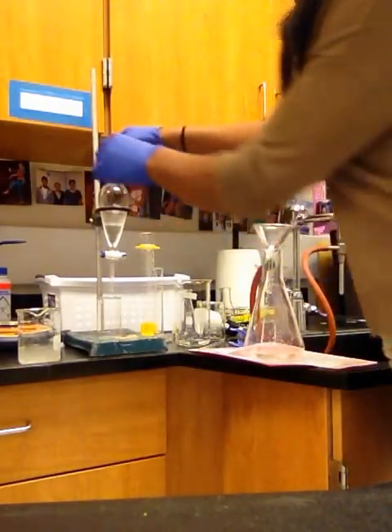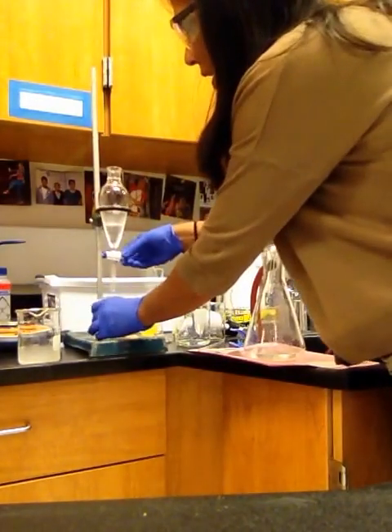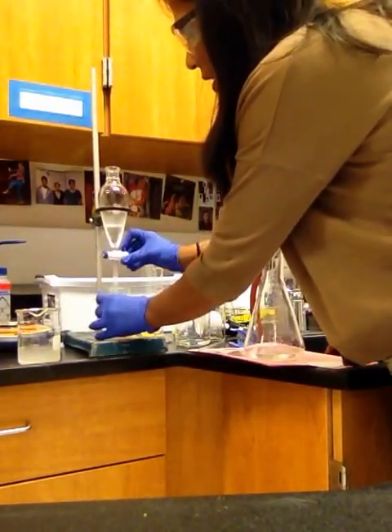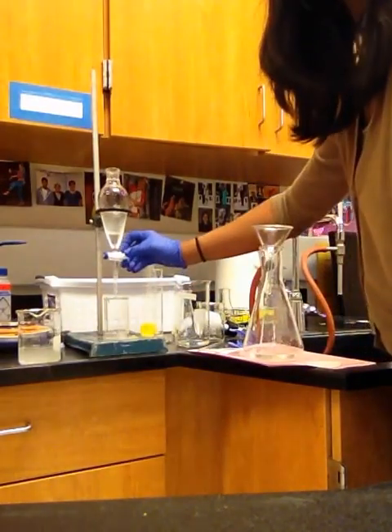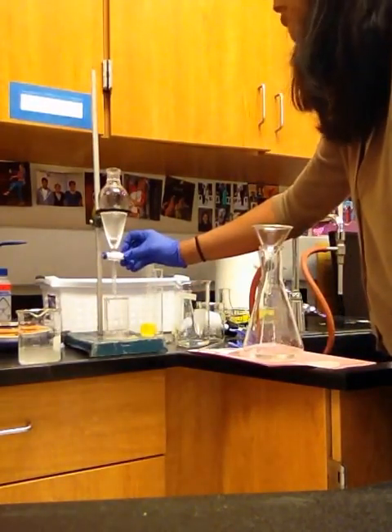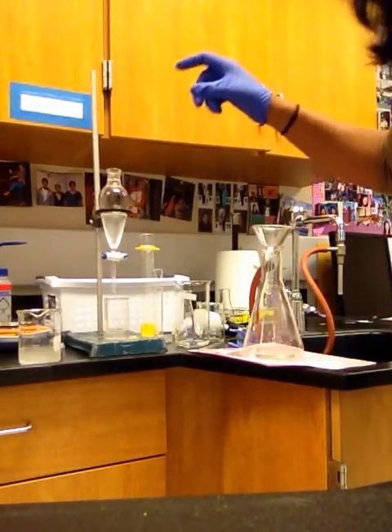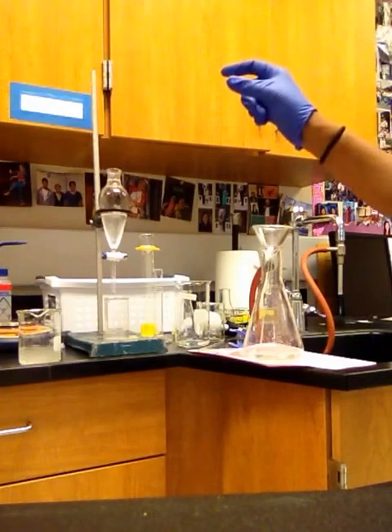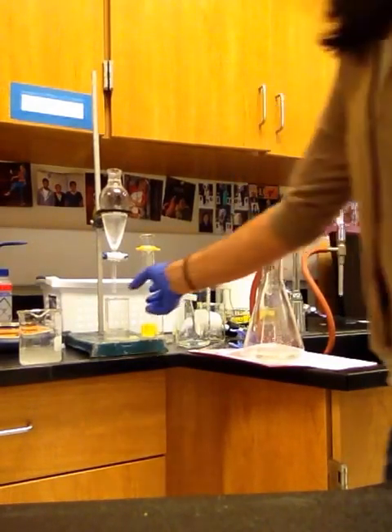Now you're going to remove the cap once it has separated completely and take out the aqueous layer into a beaker. You don't need to pre-weigh this beaker because you're going to precipitate out the aspirin using HCl. And you stop it here. You repeat the procedure with 25 more mLs of NaHCO3 to make sure you've extracted any aspirin that is in there.